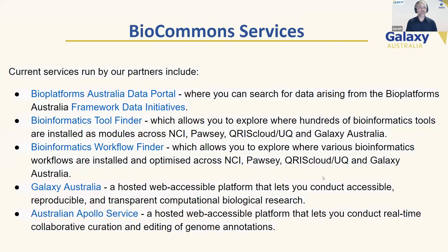By example, BioCommons is growing a suite of tools, and shown here are their mature, currently discoverable tools enabled through BioCommons or their partners, and I'll show the partners in a minute. So we start with the Bioplatforms Australia data portal, which is a repository for sequencing data, including metadata as well, which can be shared and analyzed in a well-controlled and secure mechanism.